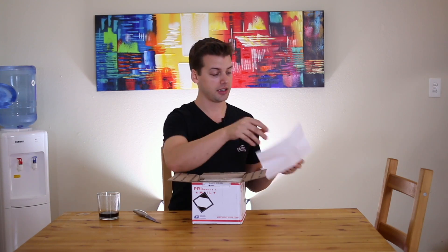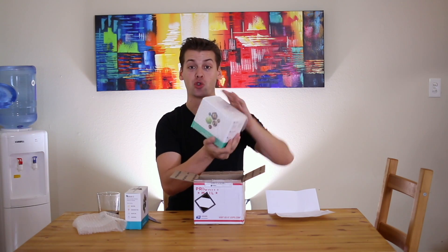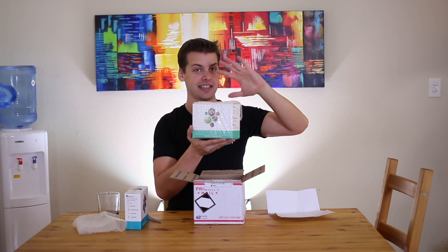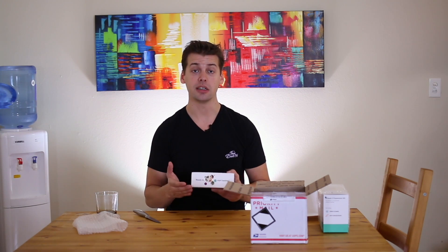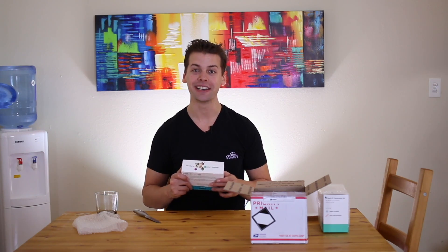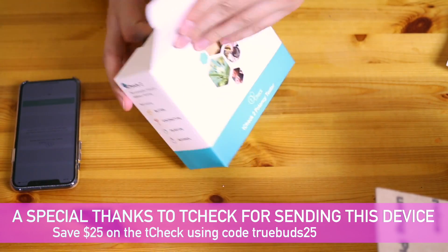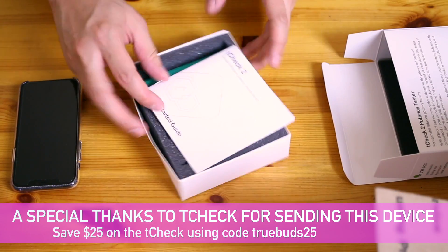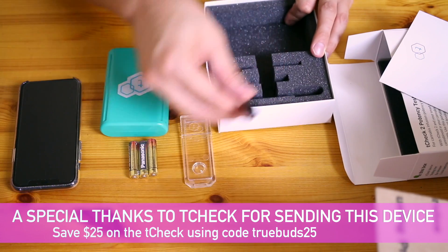Let's open this up. T-Check 2, the potency tester. Beautiful. They also hooked up the T-Check 2 expansion kit for dried flower and any concentrate. We're going to hop into that in several other videos — we're going to do some cool stuff with this. But let's just focus on the T-Check 2 for now. The device itself is looking clean: battery operated, the reusable slide, a little dropper so you can put your infusion into the slide.